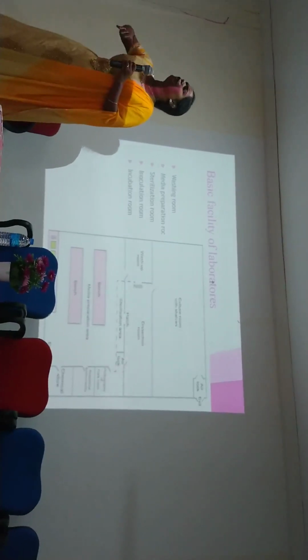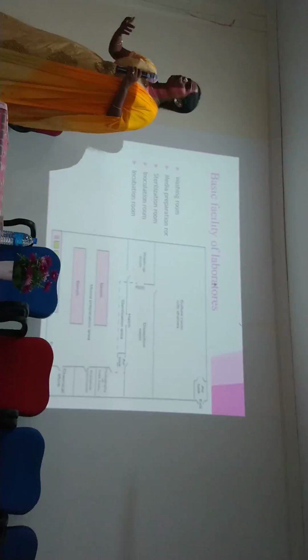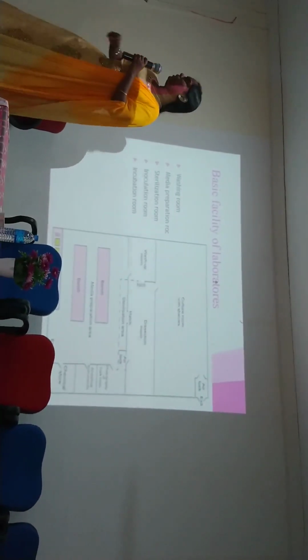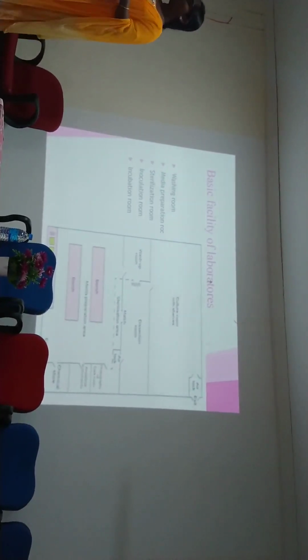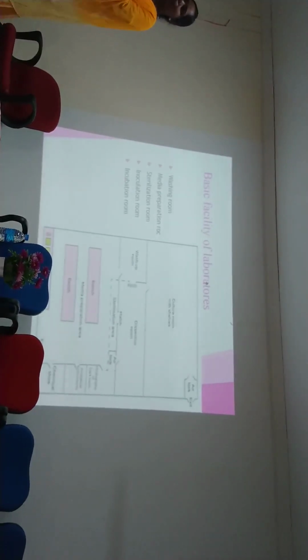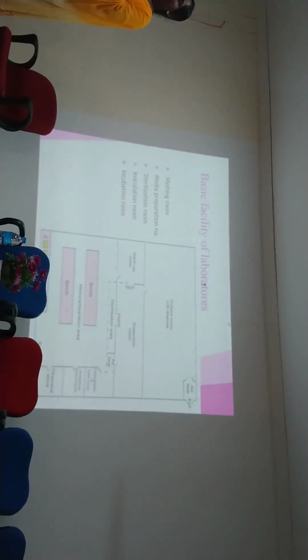What will happen if you don't maintain the pH levels? There is no growth of the plant. There is no development. We can't see the development in the plants. So for checking the pH, we need a pH meter. Then what else do we need?